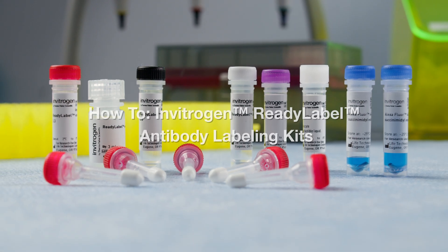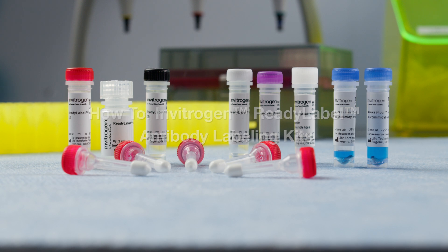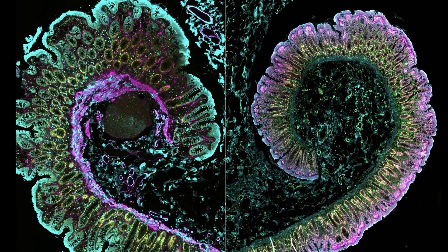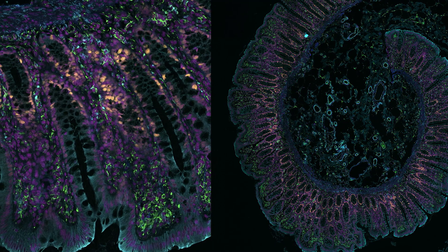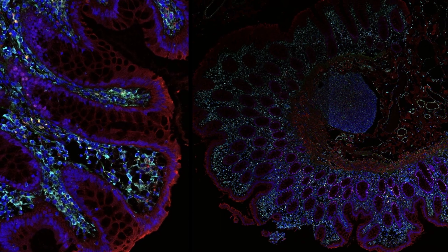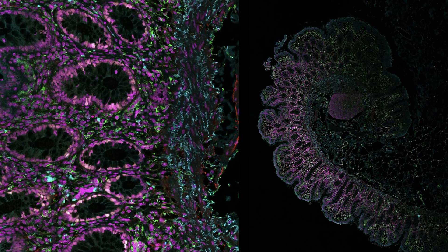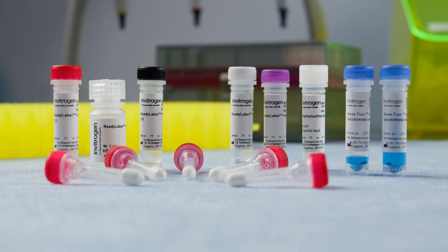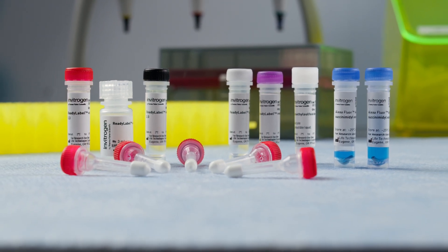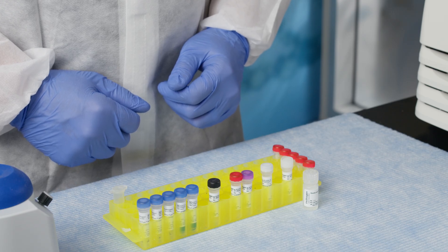Welcome to the protocol video on how to use Invitrogen Ready Label Antibody Labeling Kits. These kits are an excellent choice for researchers conducting multiplex experiments, providing purified labeled antibodies with the flexibility of primary antibody detection, all without compromising brightness and stability. The kits are available in both 20-microgram and 100-microgram sizes, and today we will be going over the protocol for the 20-microgram kit.